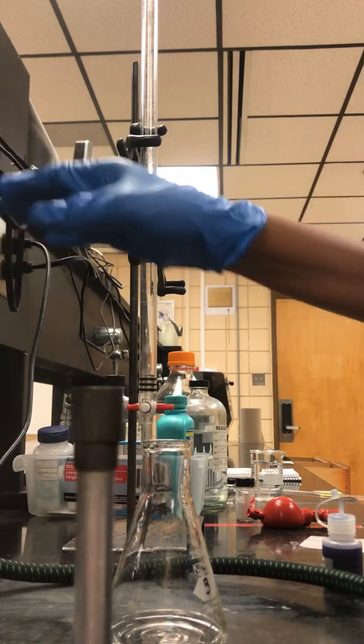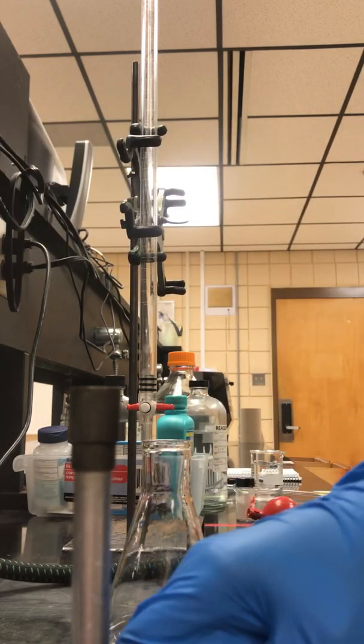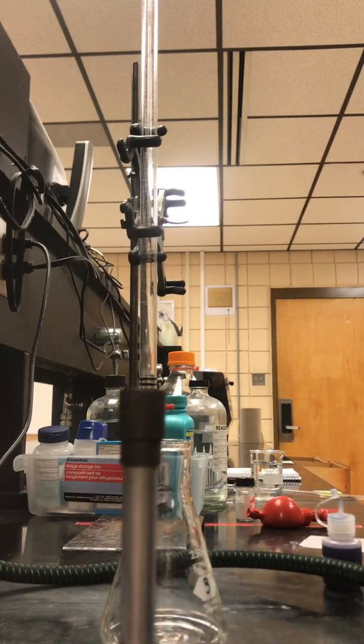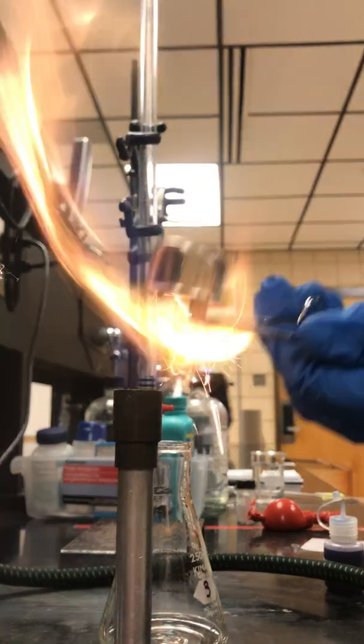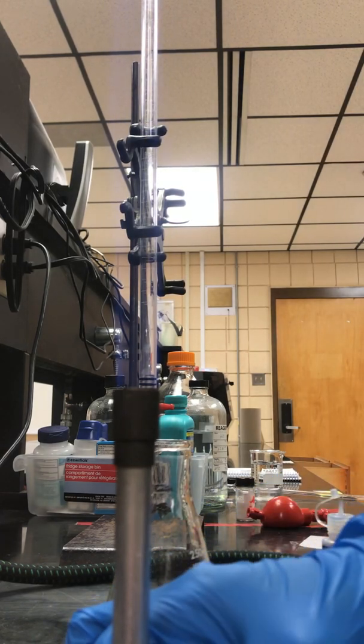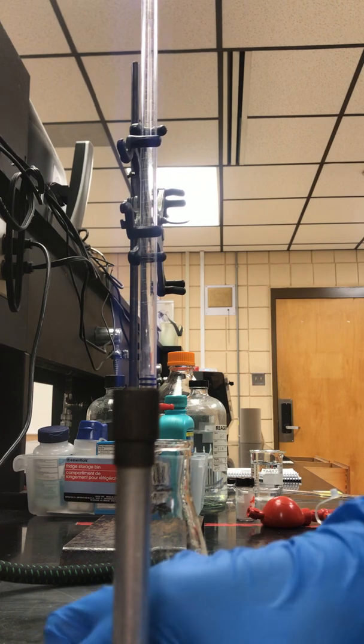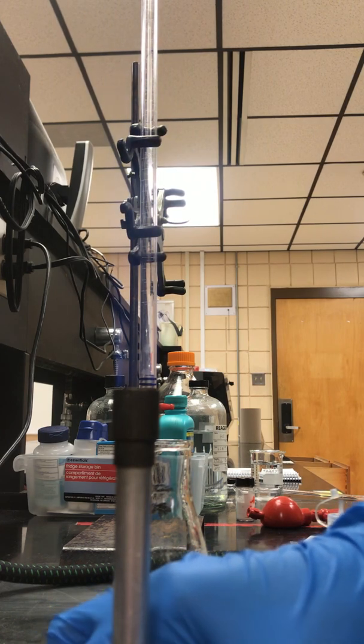We're going to light the Bunsen burner. Turn the gas knob down, you're going to smell gas. Take your striker, you should only have to strike once. Adjust your flame by turning the knob on the bottom.